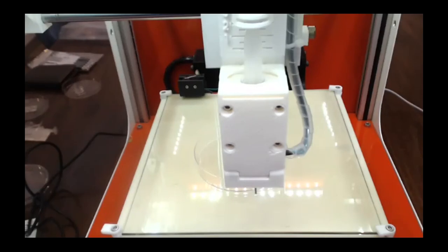So now that Oliver has the design, he's going to, again, load the model onto Pronterface. So here you should see the screen of the printer.